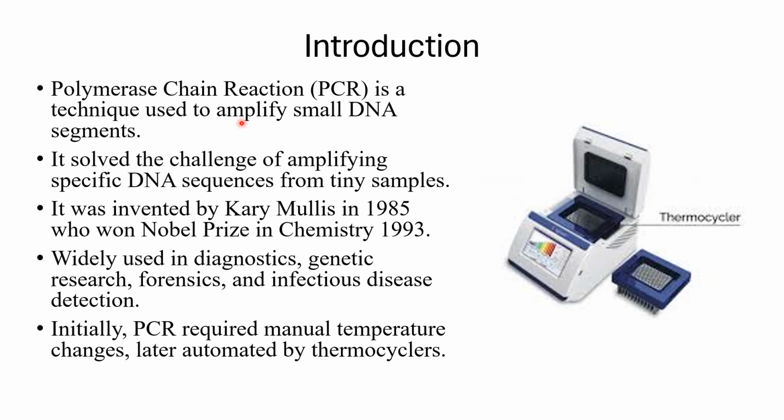However, in the early phases of infection, we might not be able to see the antibodies because they take some time to be produced, as long as 6 weeks. So even if there's one copy of the HIV virus, PCR can amplify this segment or this copy of DNA and allow it to be identified as being present.